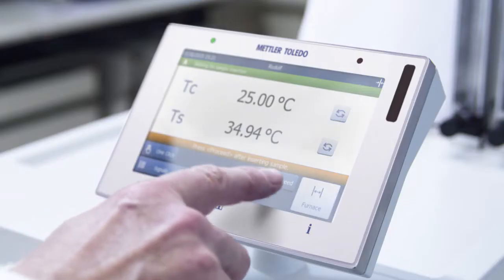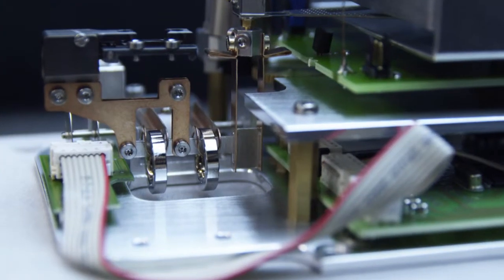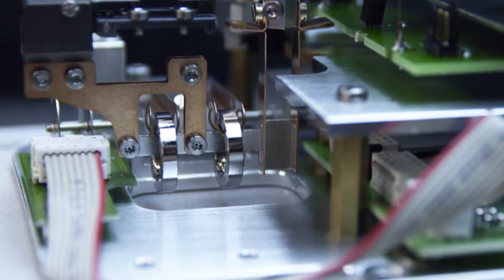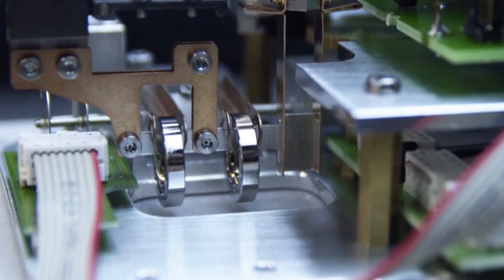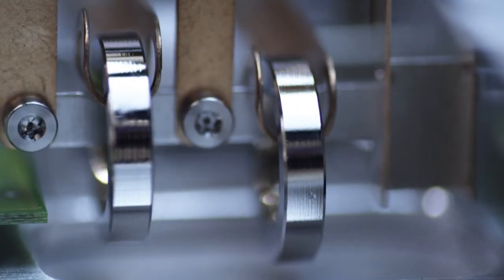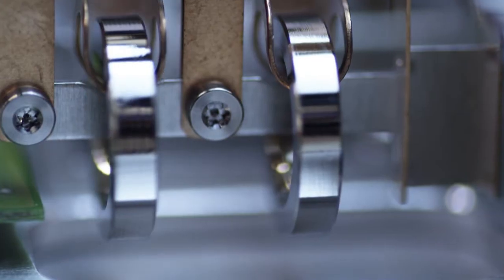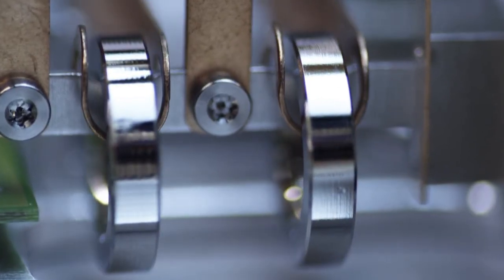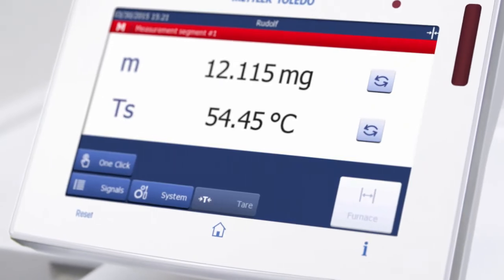The heart of a TGA is the balance cell. Our TGAs use the world's best Mettler Toledo micro and ultra micro balances. The internal calibration ring weights and parallel guided balances guarantee unsurpassed accuracy.